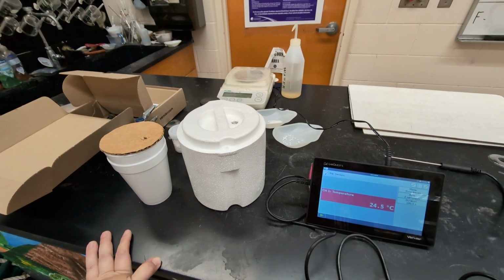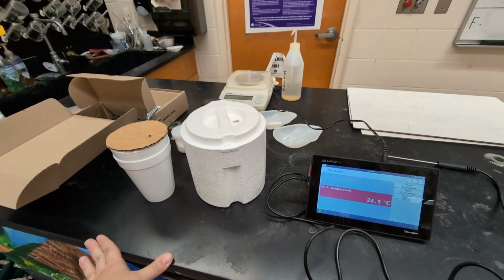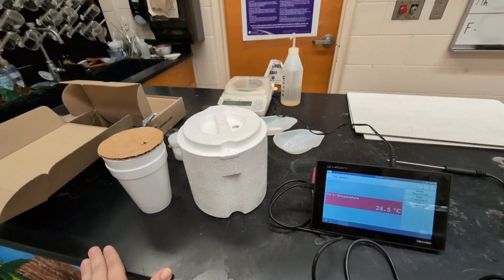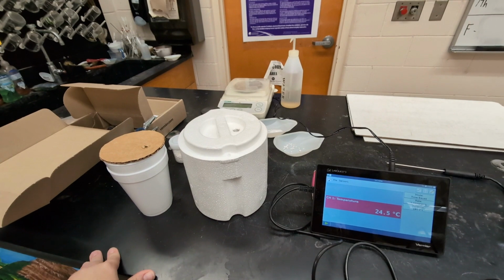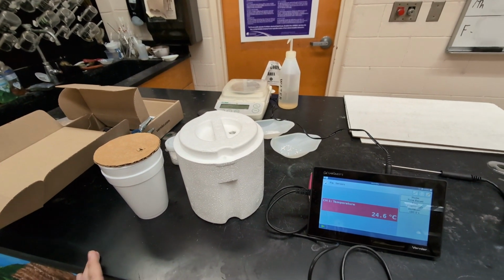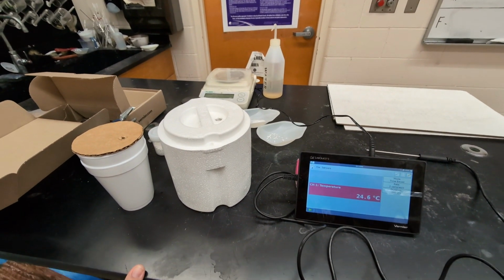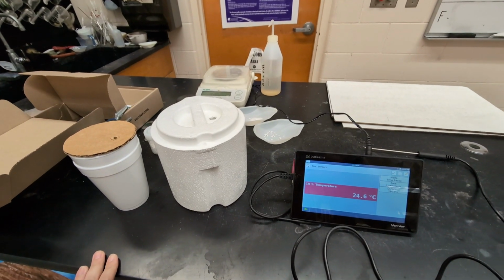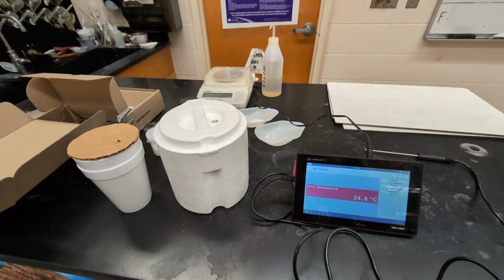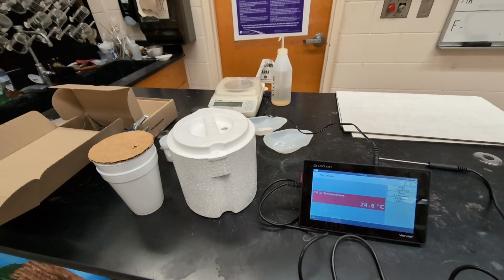So you don't have to use anything super fancy, but students definitely need to know about procedures for calorimetry and the sources of error for calorimetry, and how to calculate using Q equals MC delta T, how to identify endothermic and exothermic reactions. So heat of solution is one way that you could do this. You could also do a heat of reaction. A good one is hydrochloric acid reacting with sodium hydroxide. That's exothermic. You can measure the temperature change and then find the kilojoules per mole release for the heat of reaction.